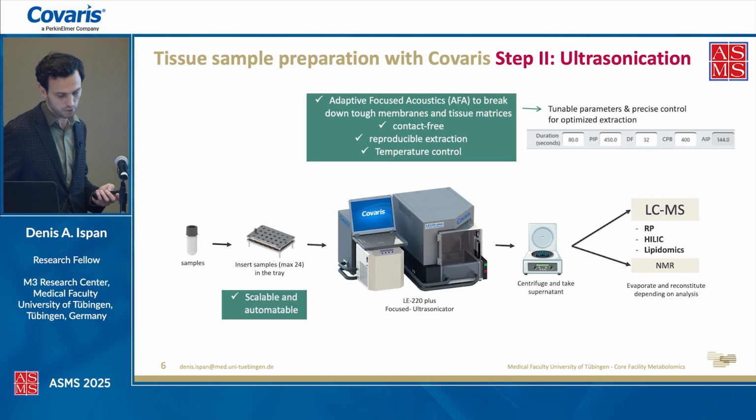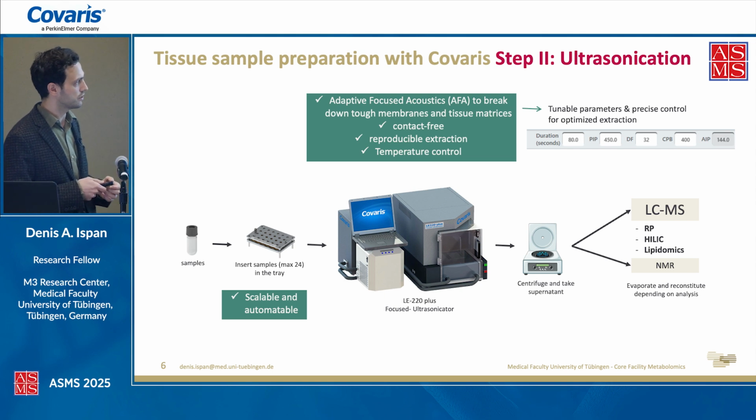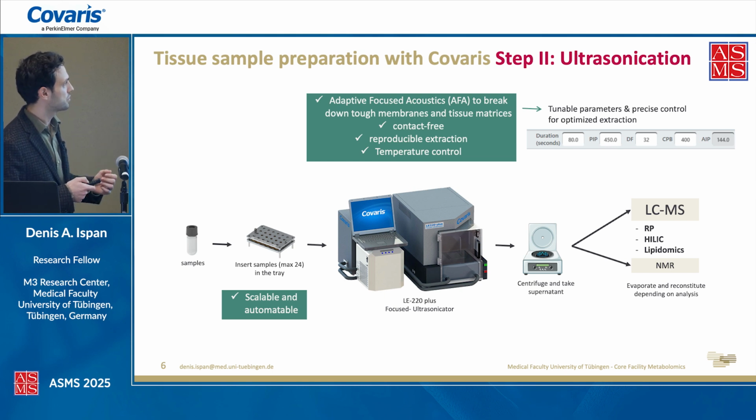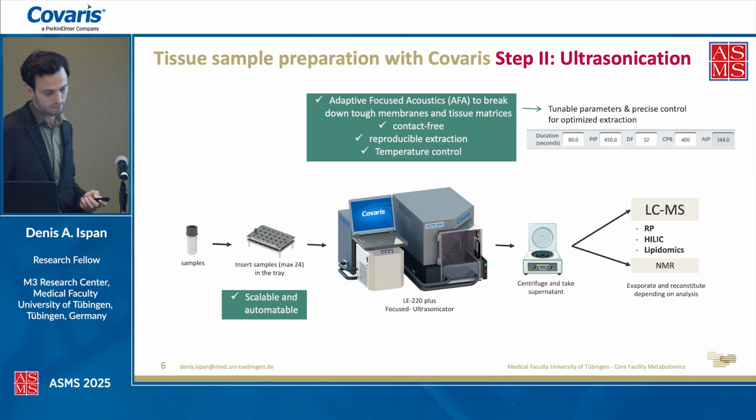After adding the appropriate solvents, the next step is ultrasonication with the LE220 plus. Samples are inserted into the tray. We can insert up to 24 samples, and it runs 4 in parallel. This allows us higher throughput processing and also minimal hands-on time.